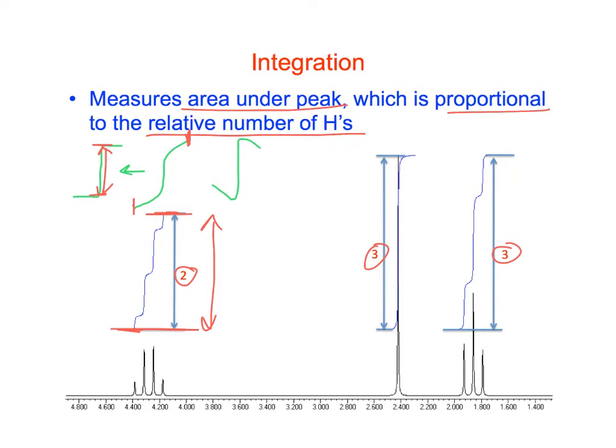Yeah, so this one would be from this point to this point. This would actually be measuring this distance, and this is too small, right? And this one is going from the top, from here, clear up to here, and so this one's too big. So this is why the phasing is also very important.